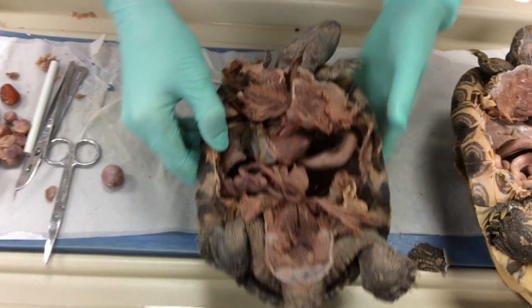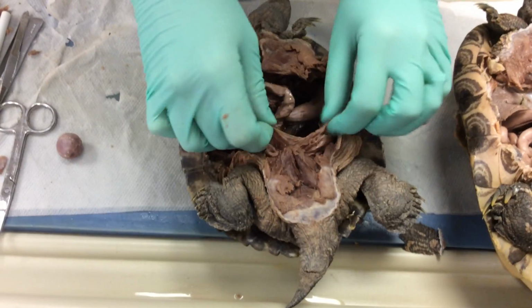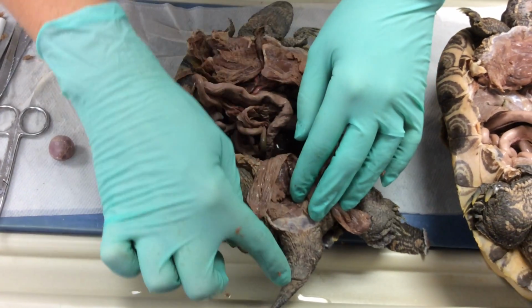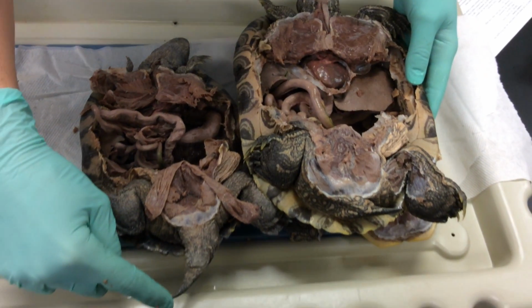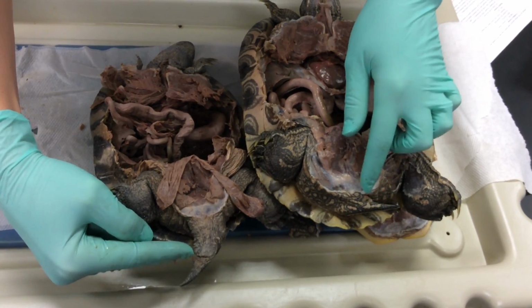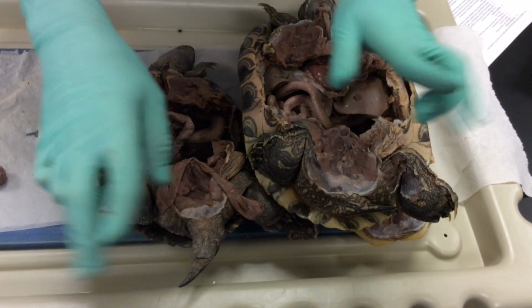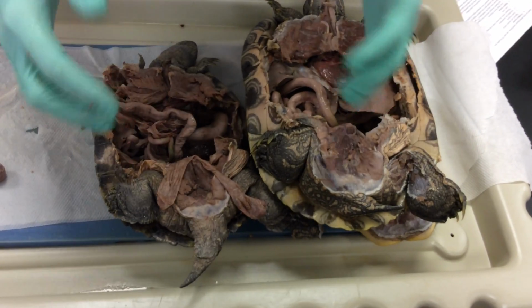All right, so we're looking at the male here, and obviously we're not going to have any of those other structures like the ovaries, but we still have the urinary bladder that's pulled back. This is still the pelvic girdle and the cloaca. And if you notice the difference in the tail, look how much longer the tail for the male is than it is for the female. And look at the distance between where the cloaca is located. The male's cloaca has to be located further because during reproduction they do cloacal kissing, and then that means that these two things are going to line up together, and it just makes sense that it would work out that way.